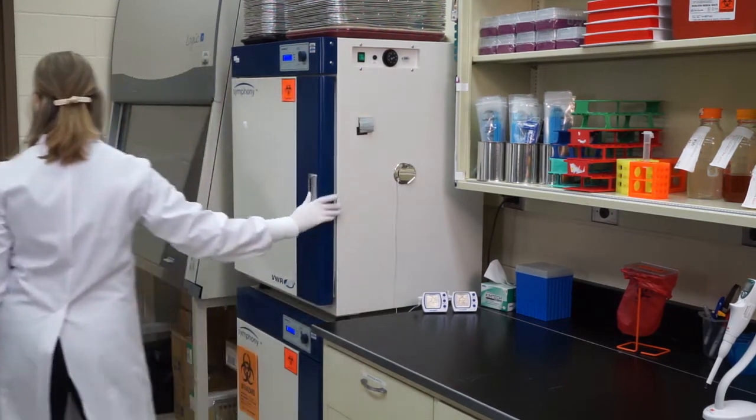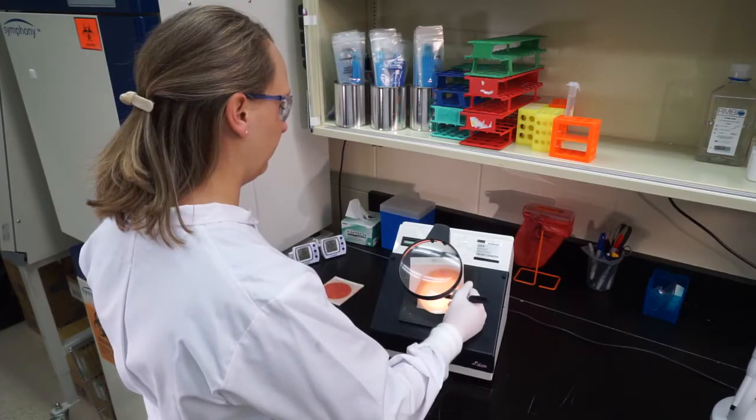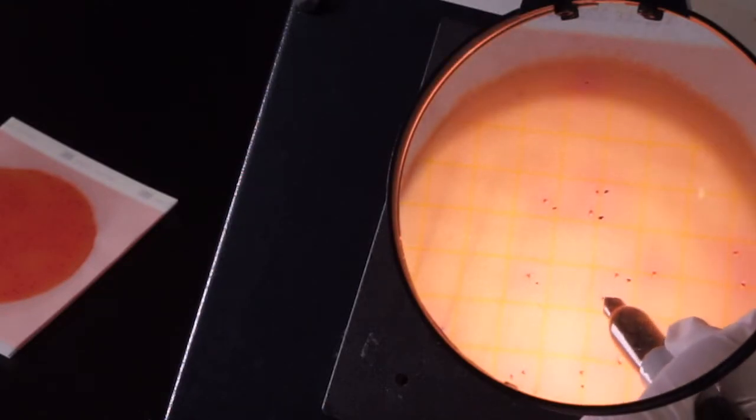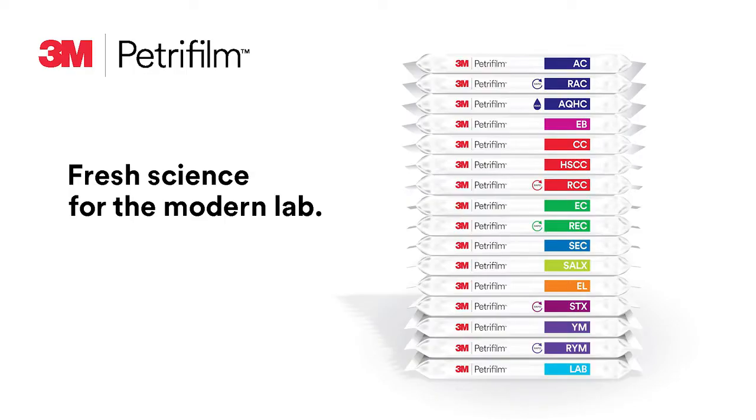Step three: interpret. Indicator dyes in each 3M Petrifilm plate facilitate colony counting. Use a magnifying glass, hand counter, or counter pen, or mark directly on the plate's top film to tally the results.